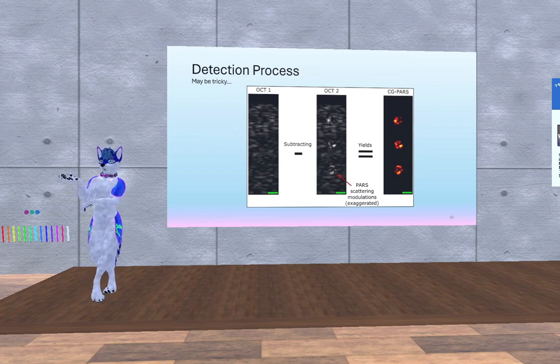And when I'm saying a living thing, I'm usually referring to an actual living animal or person. Then you start to run into all kinds of other issues, like the fact they're breathing, they have a heart rate. And if you're trying to do microscopy, even if you're just looking at a capillary network, the heart's pumping, so it still moves and it still pulsates.